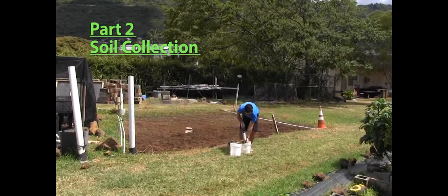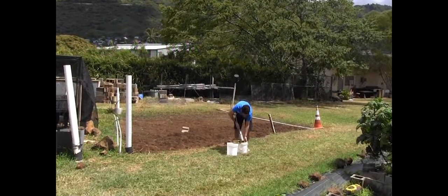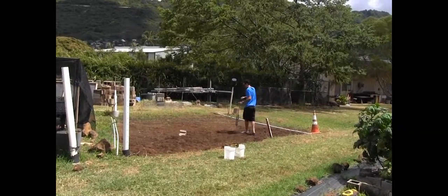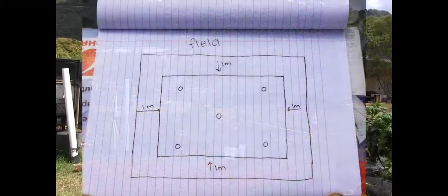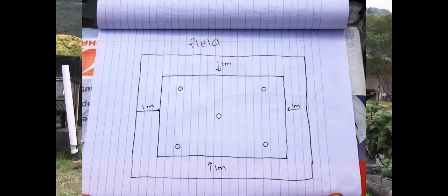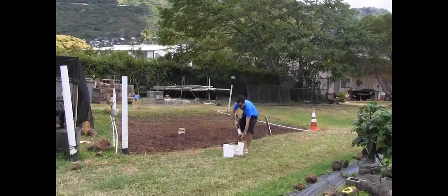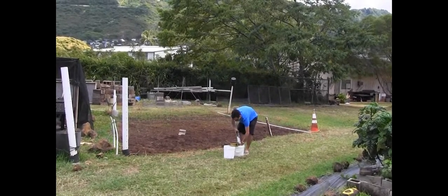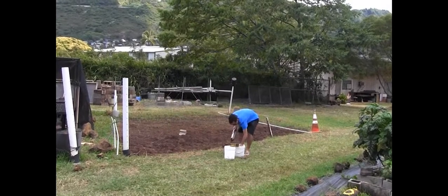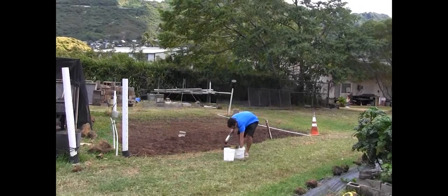Here's John in our field — he just took the first core putting it into the bucket. As you can see he's going a little into the field to take the soil samples, and that's because of that one meter buffer area from the edge of the field to where we're sampling. When he brings the next core into the bucket he's going to get the soil out of the core and then he's going to make sure to really mix the soil cores together.